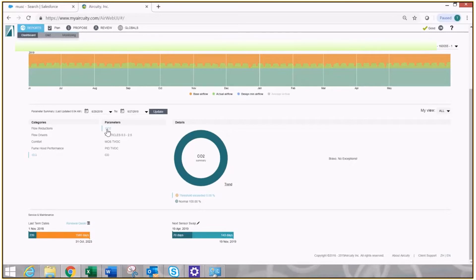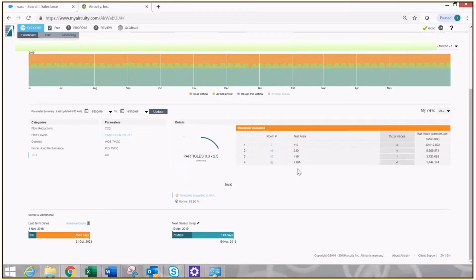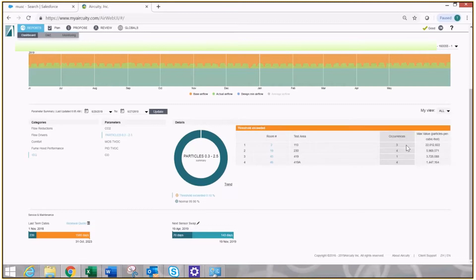have exceeded the threshold value that I determined appropriate for carbon dioxide. The system says none. You have nothing to do this week on that. I'm going to go to my small particles, respiratory grade particles. It's going to scan the entire building. It's going to find four rooms that have exceeded, but the occurrences are low enough that I'm not going to worry about those. Nothing to do.